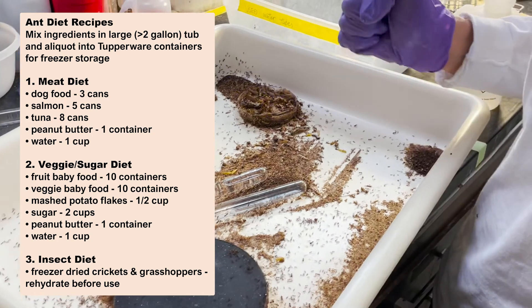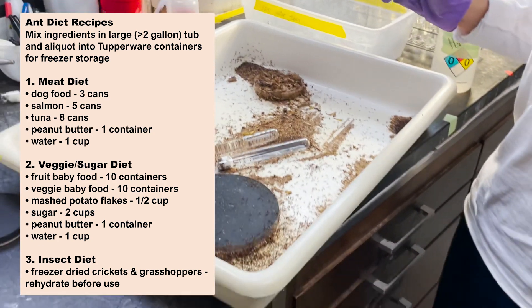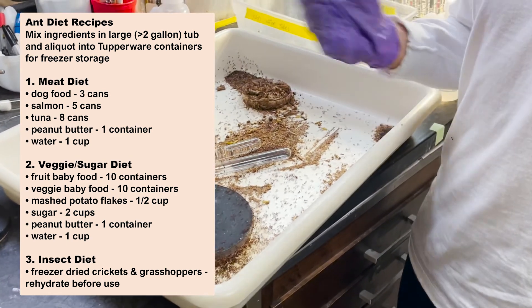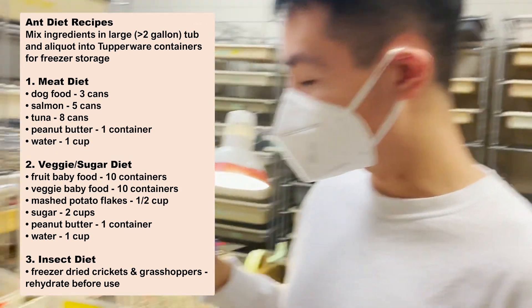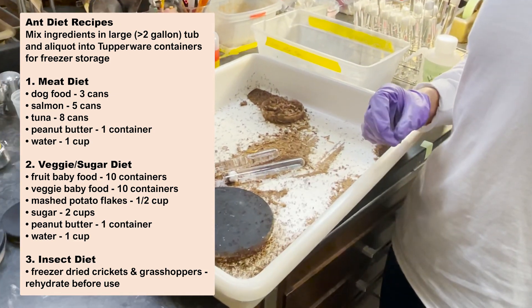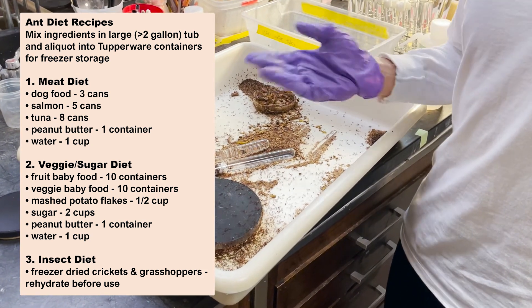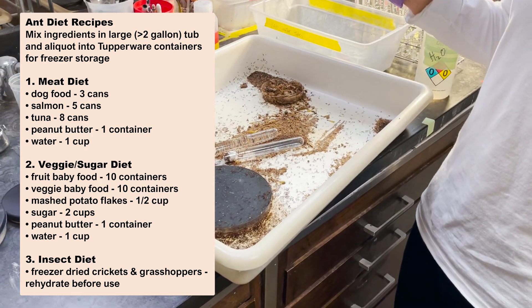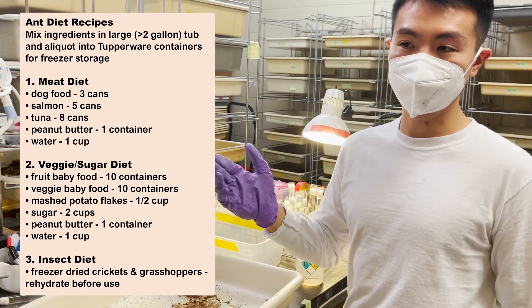There are two main types of food. One provides carbohydrates — it's a mix of baby food, peanut butter, mashed potatoes, and sugar. It's very delicious and sweet; I've tasted it myself. We also give them a protein food, which is a mix of dog food, tuna, salmon, and also peanut butter. And we give them insects — we now give them rehydrated dried grasshopper crickets.